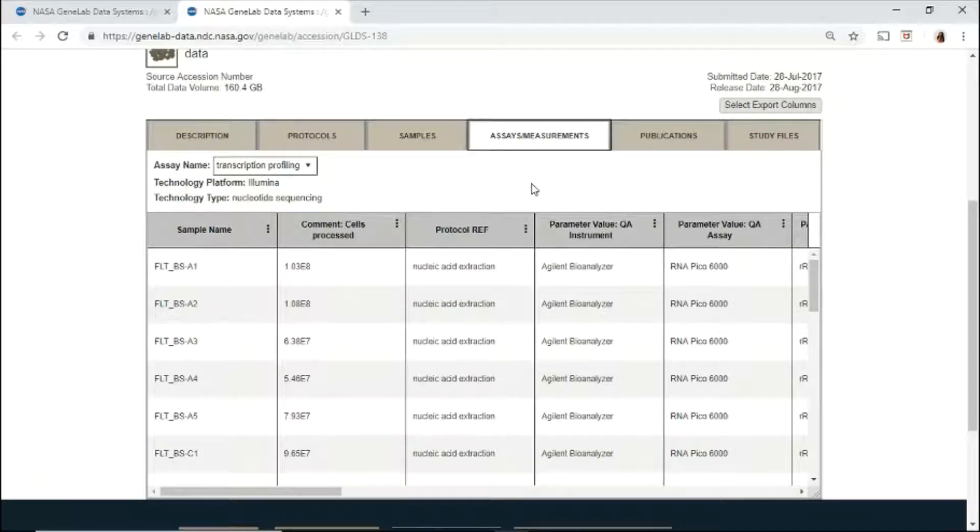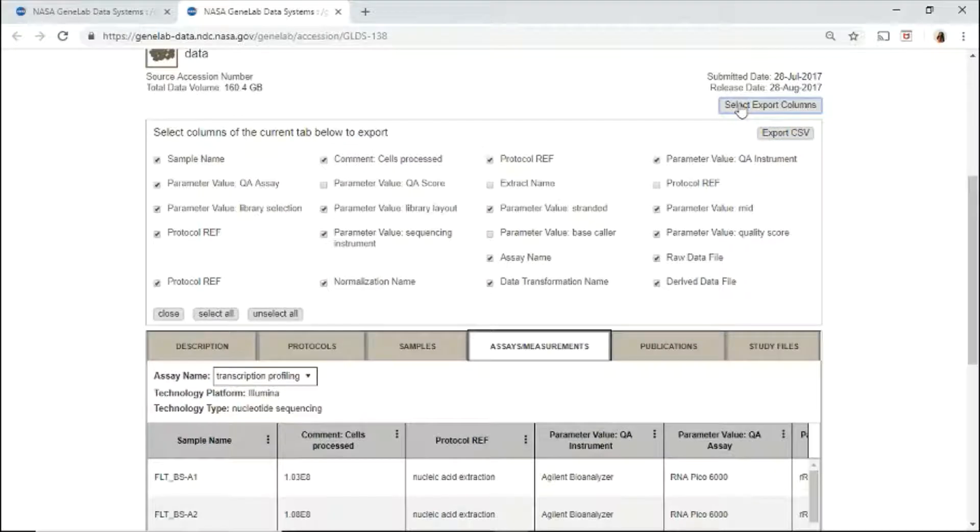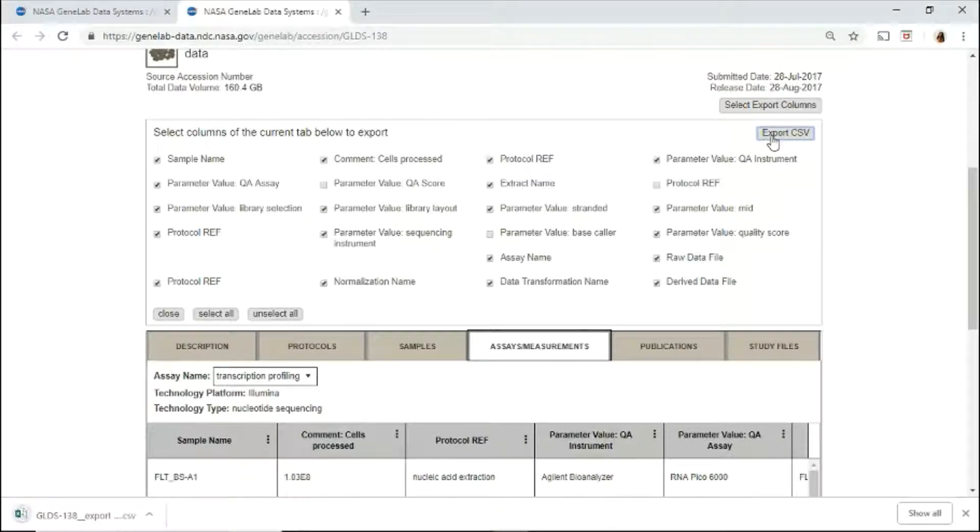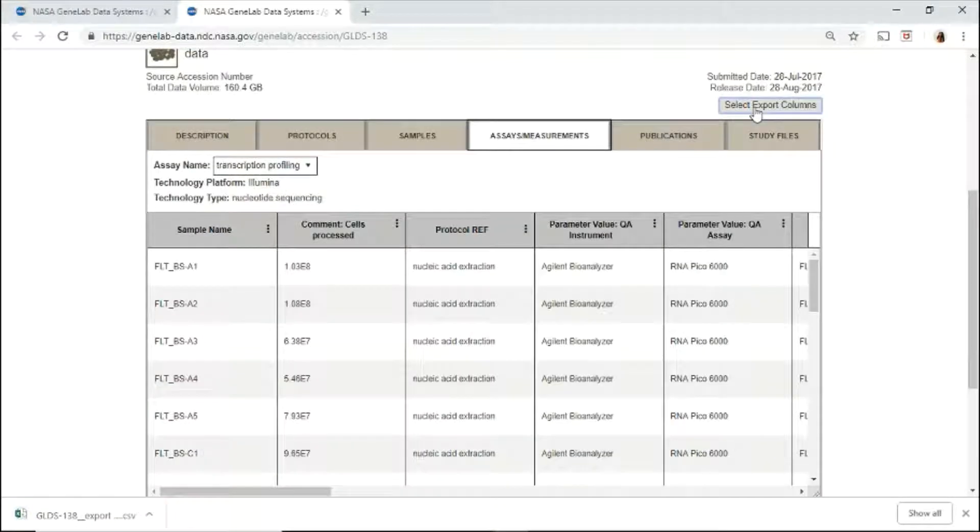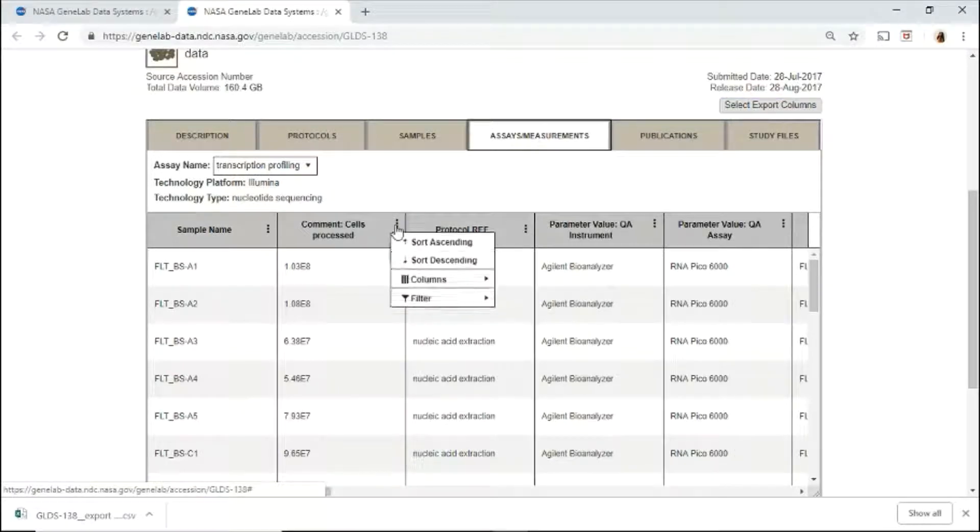The samples and assay tabs provide sample and assay level information about the experiment. You may export the sample or assay table by clicking select export columns, select the columns of interest, and click export CSV to download your file.